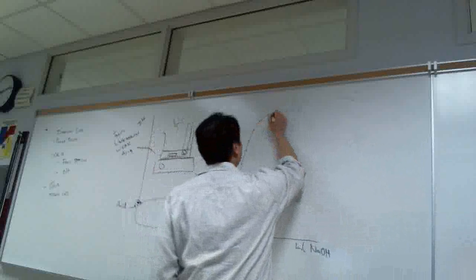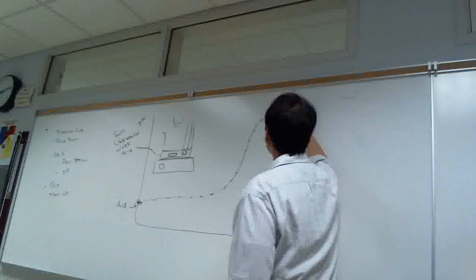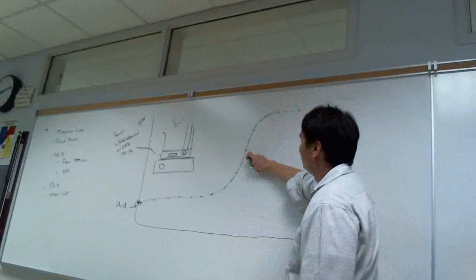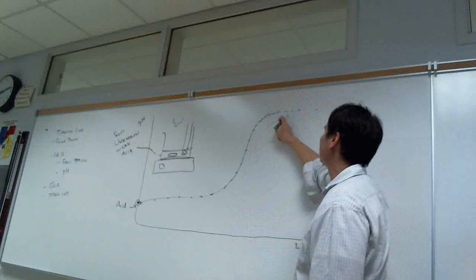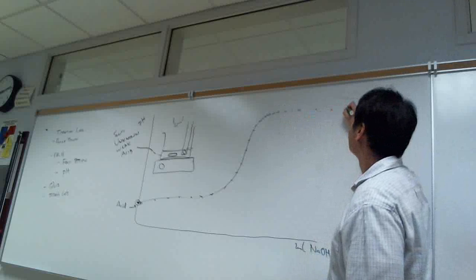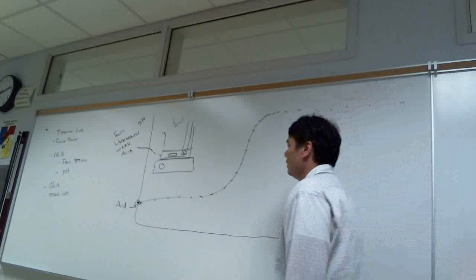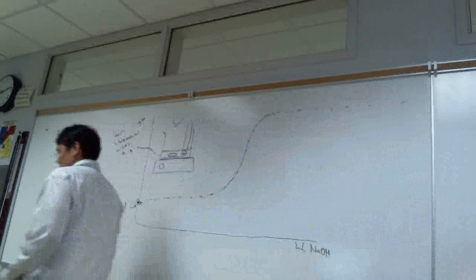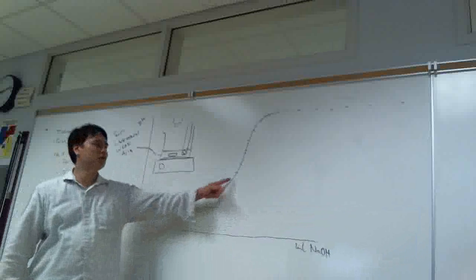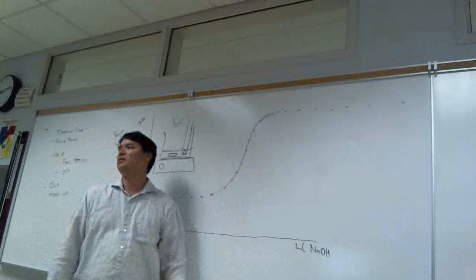And then up here, where it kind of flattens out again, and nothing much is happening, we can widen the interval. Especially, we aren't going to stop at the equivalence point or the end point. We're going to just keep going past it until we see it's not really changing much up here. And so we can jump up to much larger intervals near the end of this. And so the problem is when do we slow down? Because, you know, if you overshoot this by a drop or 2 drops, it's already gone. You know, it's done. And so when do we slow down?